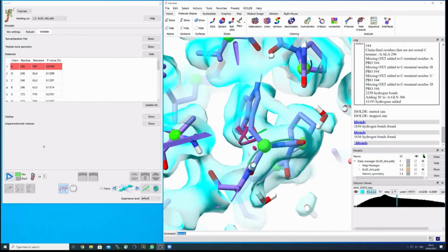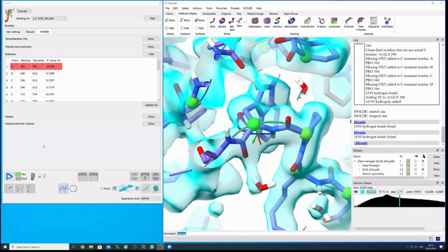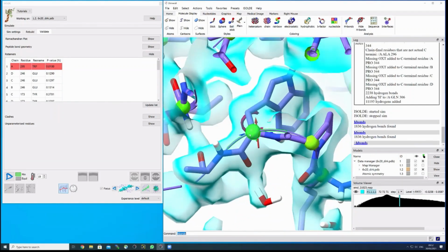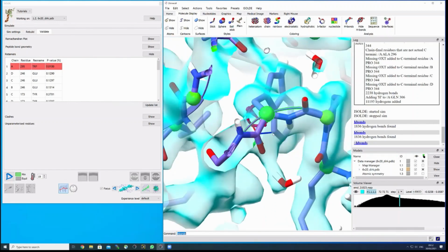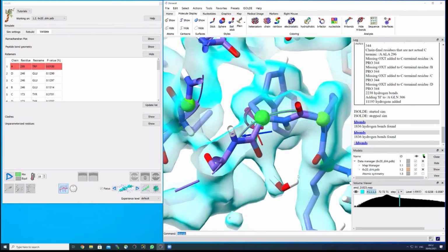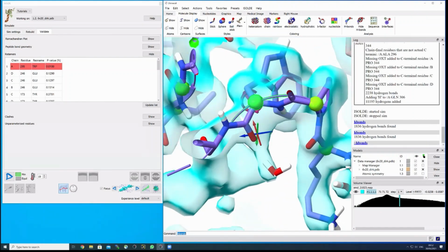And I would like to come to the last part for today, which is, can we also build some residues newly in Isolde? For this, I would like to move on in the structure to other positions. And of course, I did this to the model. This is why you have a version that was generated by me. To make things a bit easier, I first would like to get rid of the waters. What you see here at position 402 is a water molecule. The map is so good that you can actually start seeing the hydration shell of the protein. So you can start modeling waters.